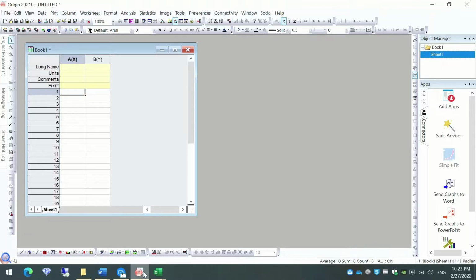In this video I am going to show you how to plot a graph in Origin software, and this software is really important and nice. So let's just get started with this.